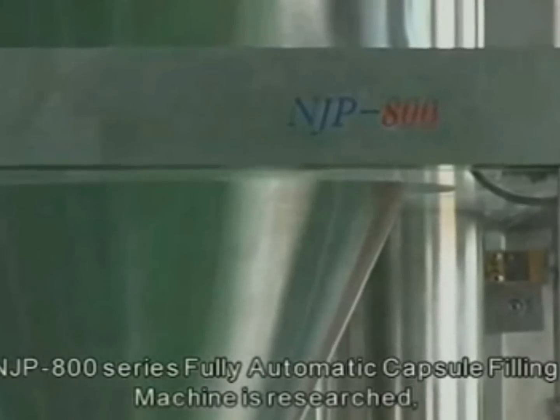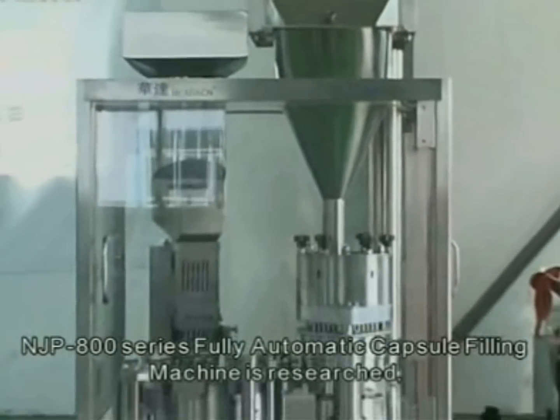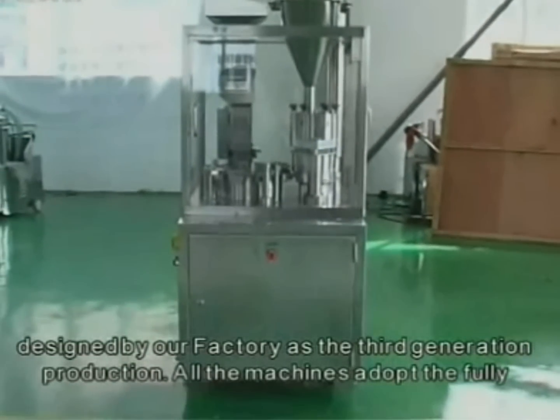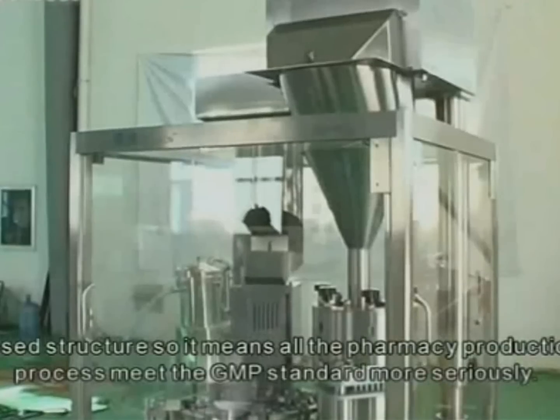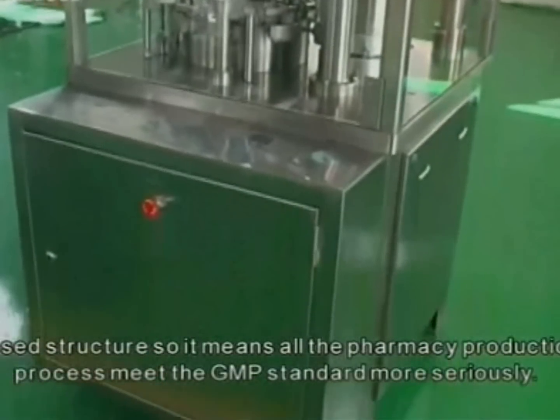The AP 800 series fully automatic capsule filling machine is researched and designed by our factory as the third generation production. All machines adopt the fully closed structure, meaning all pharmacy production processes meet the GMP standard more seriously.